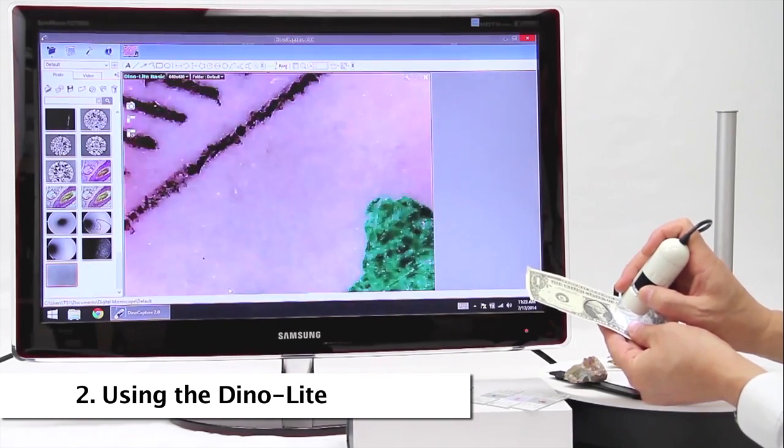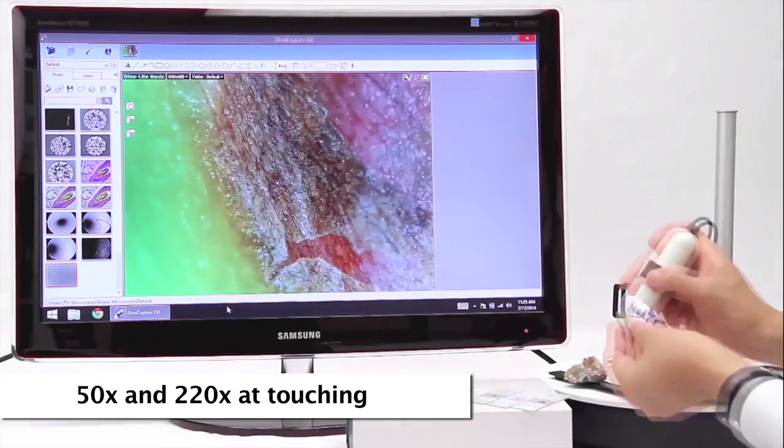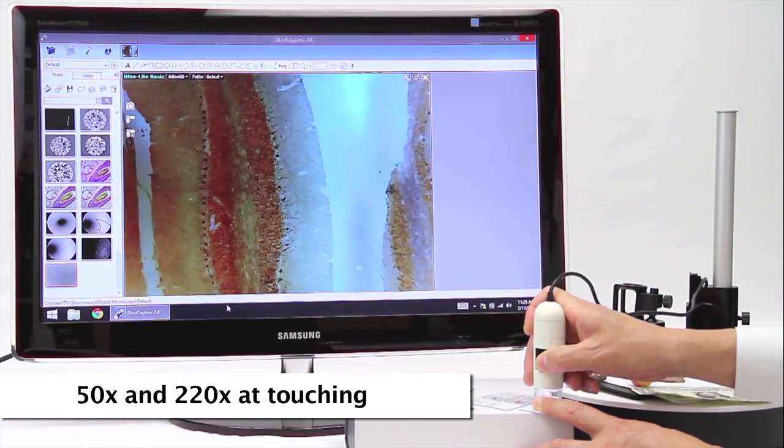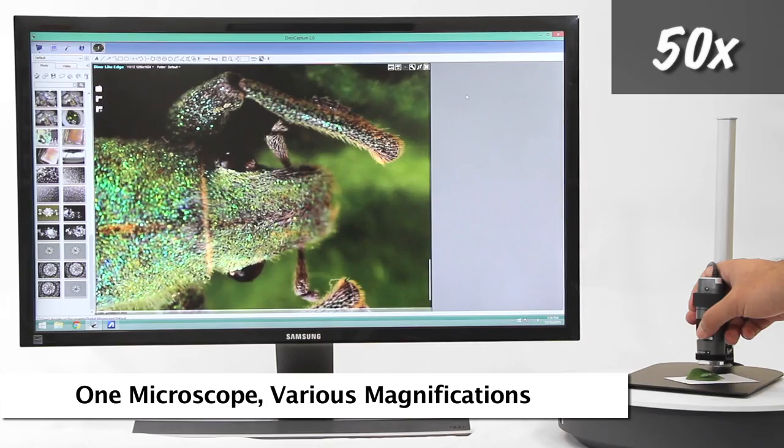Standard Dynolite working distance allows for 50 times and 220 times magnification when the end of the Dynolite nozzle is in contact with the object being viewed. This is an example of the standard working distance and corresponding magnifications.